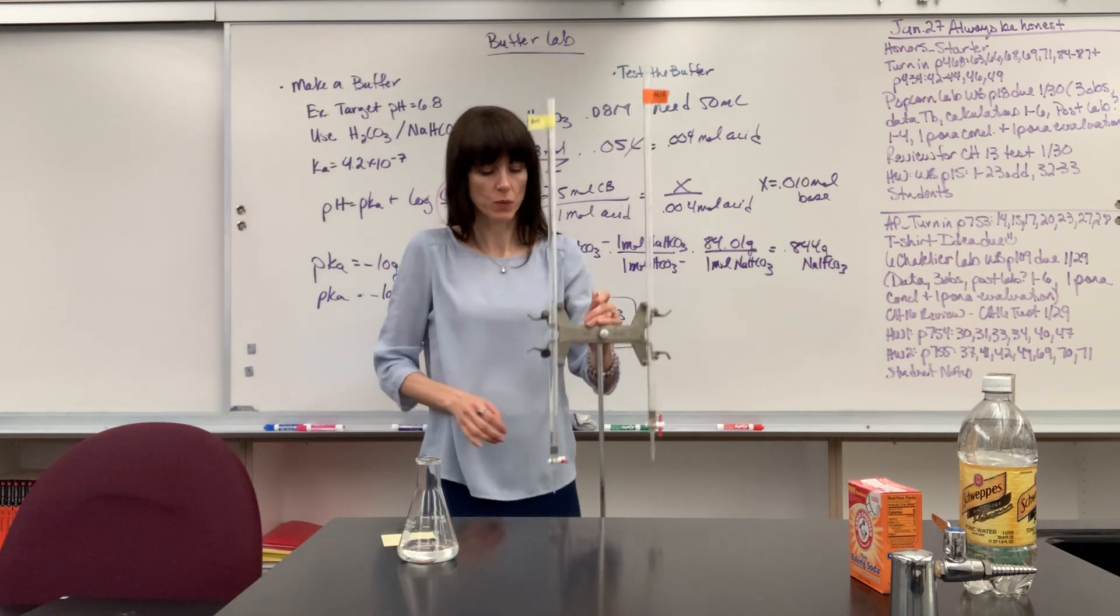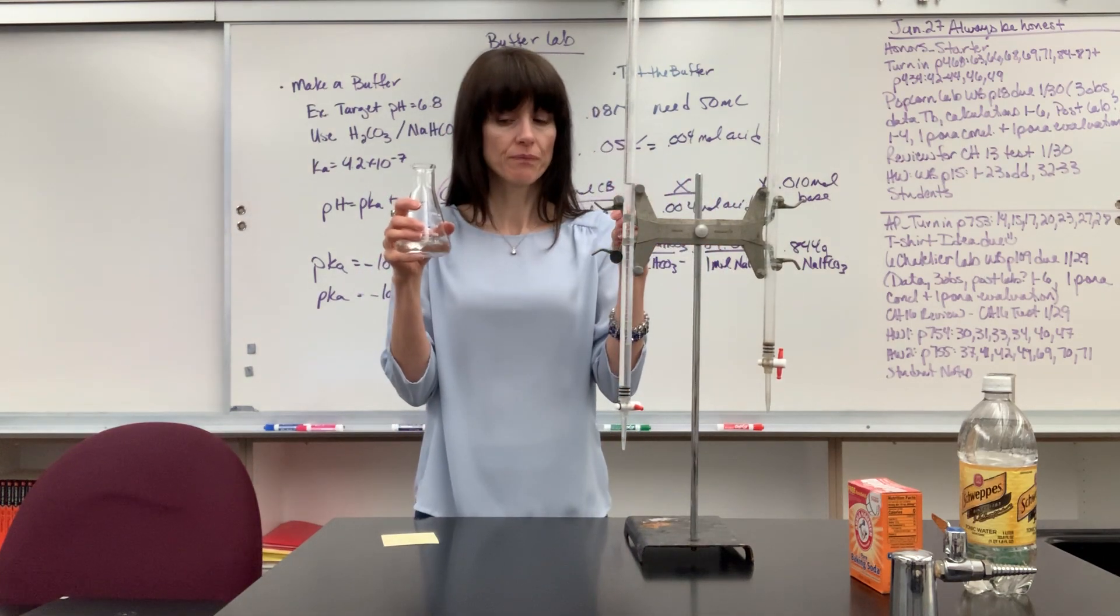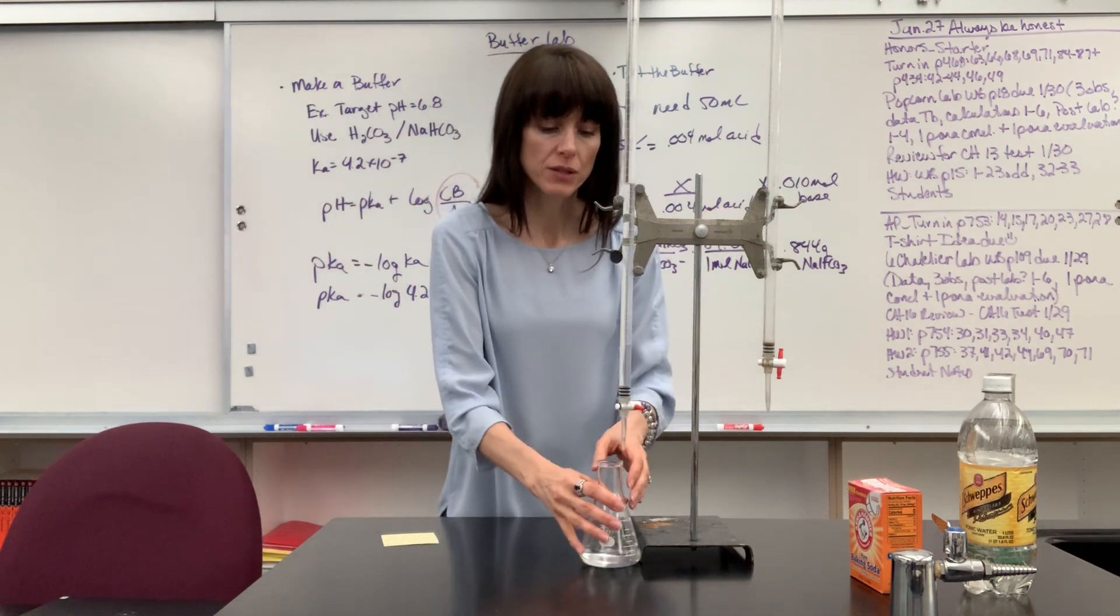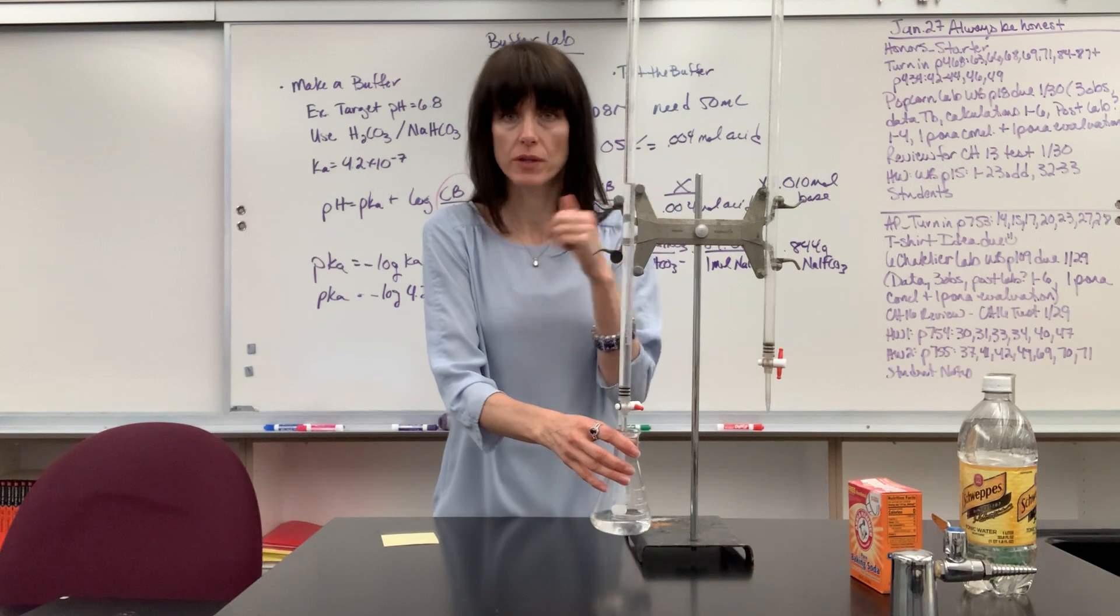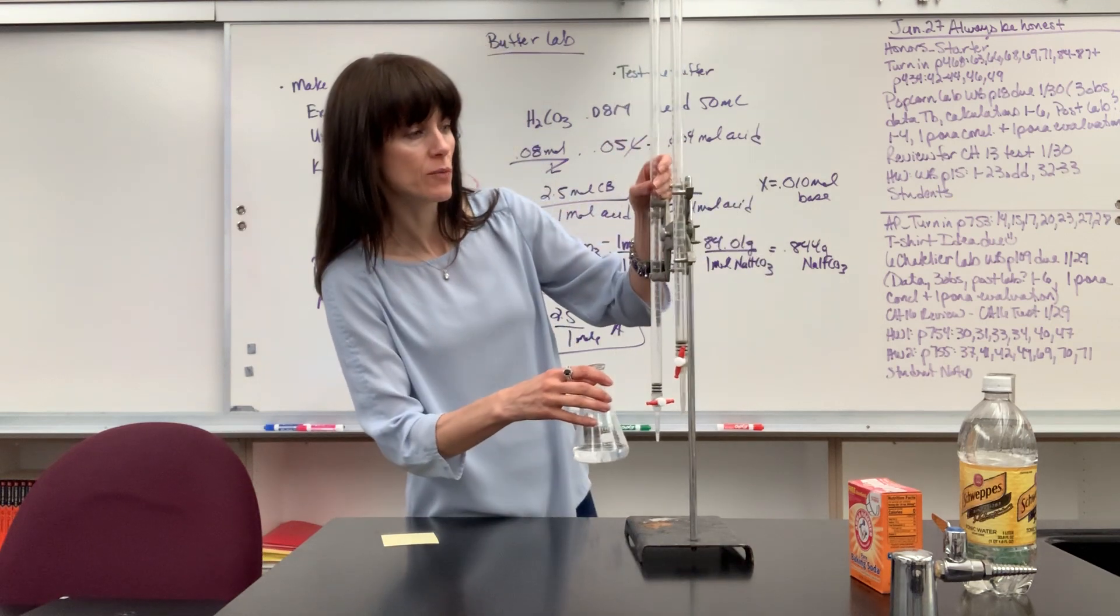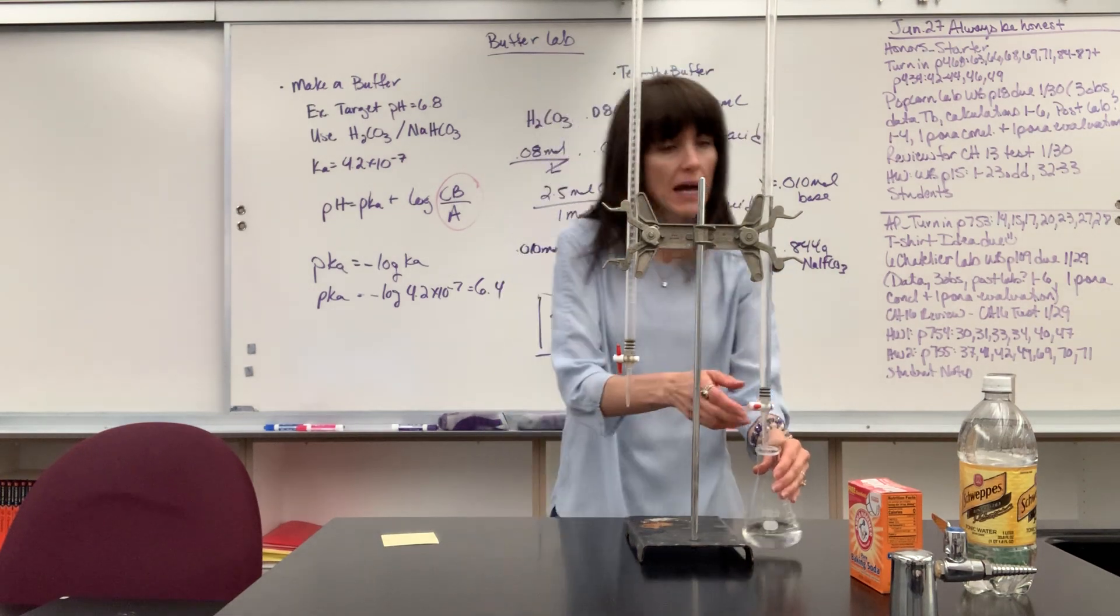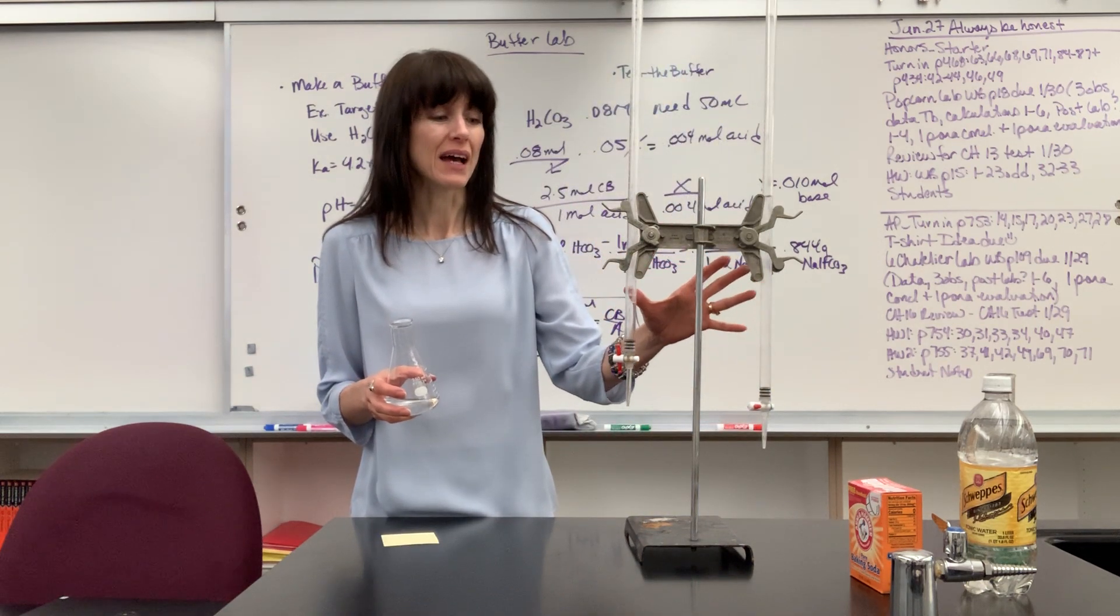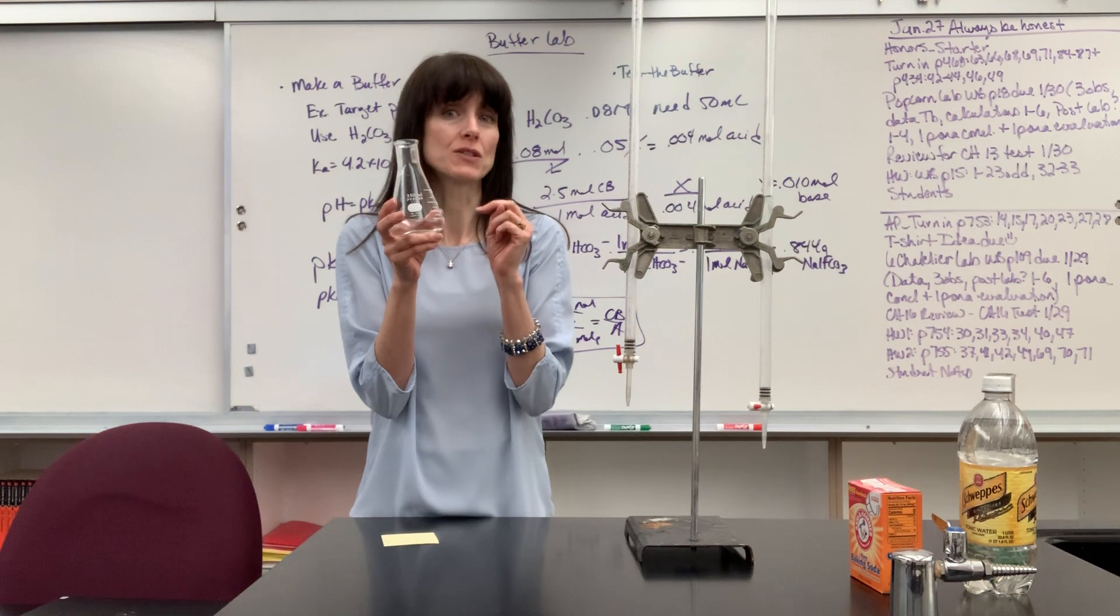So I will take my 50 mils, divide this in two. I'll have 25 mils in one Erlenmeyer flask, 25 mils in another Erlenmeyer flask. And what we're going to do is with the pH probe, I will add a half mil of my base, record the pH, add a half mil. So I'm here, add a half mil. And I'm watching as I'm adding it. Okay, I'm reading this. I'm watching. I'm adding right here. I'm adding my half mil, record the pH. Add a half mil, record the pH. Add a half mil, record the pH. Honestly, we should be able to add at least 10 mils of each of these. And pretty cool, this will stay plus or minus one pH point.